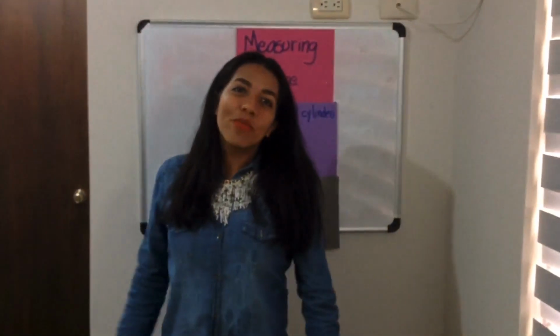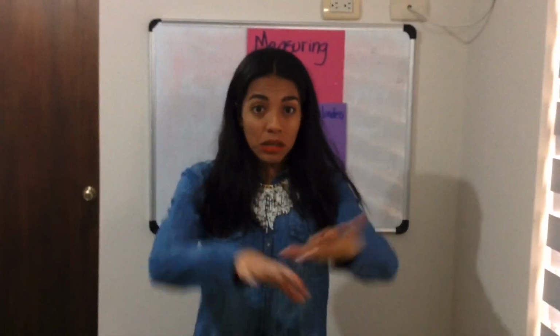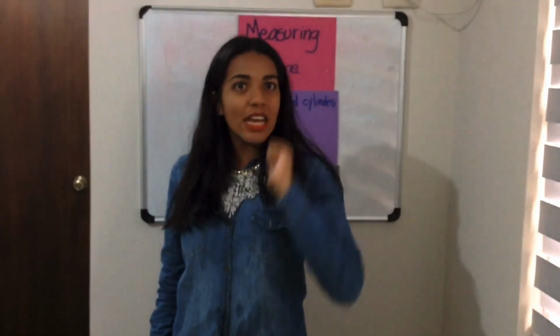That is going to be everything for today's class. Please remember how to measure volume by using these instruments, and the units of measurement are liters and milliliters.